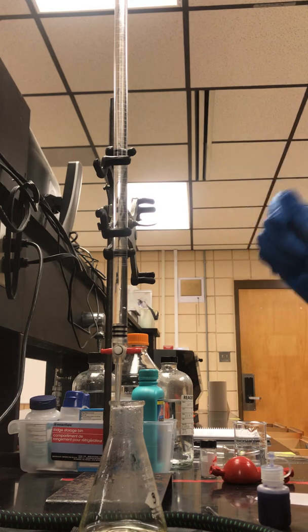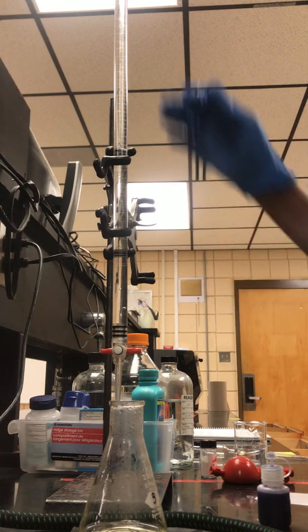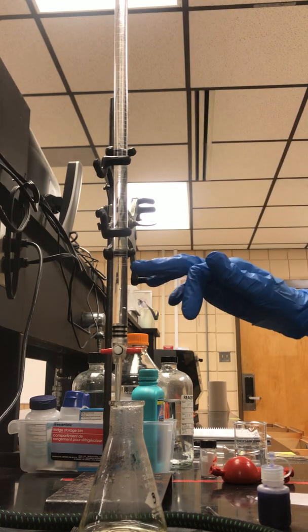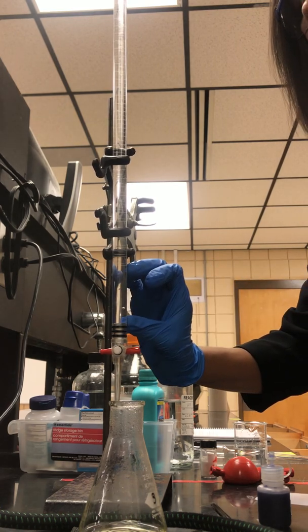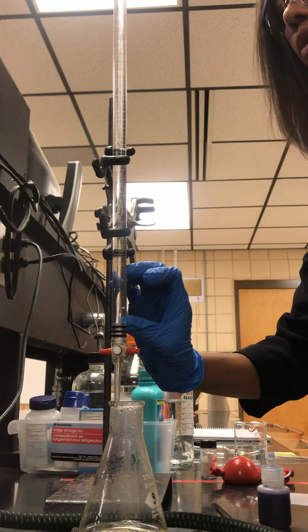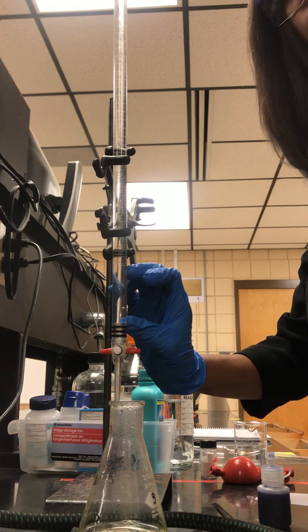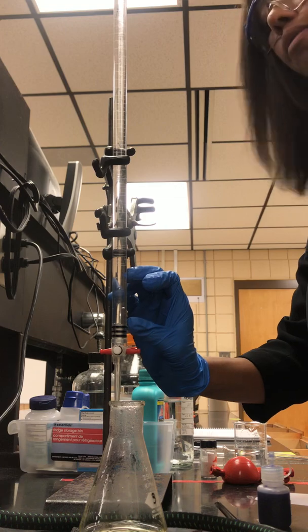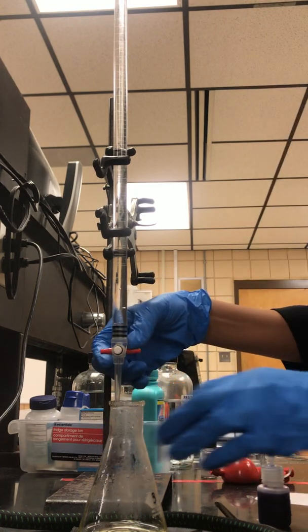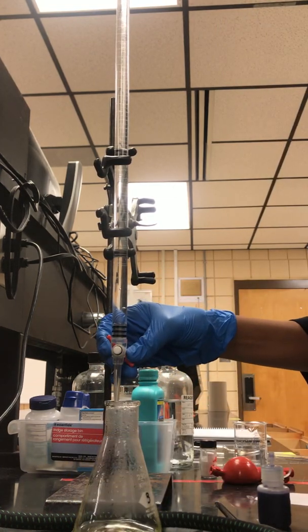Read the burette and record my initial volume. Remember it starts at zero and if you come to the bottom it ends at 50. You have this space where you do not have any graduations, so carefully watch that you don't come into this area or you'll have to repeat that titration.